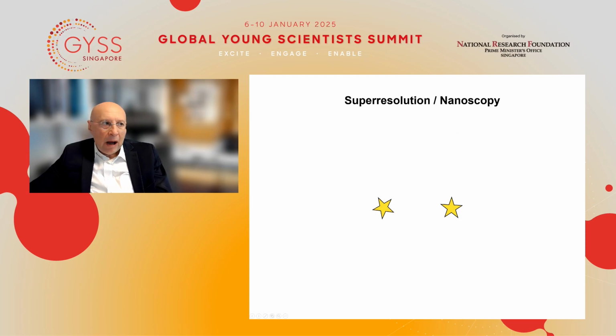Now, you should know that the basic enabling element of all super resolution methods that exist today, no matter what they call it, STED, PALM, STORM, whatever, is a so-called on-off principle. If you have two molecules that are very close, you make sure that only one of them emits, because otherwise the signal of the two gets confounded.